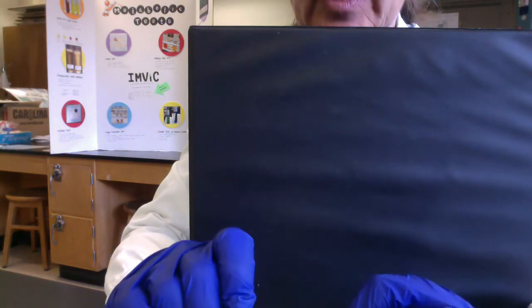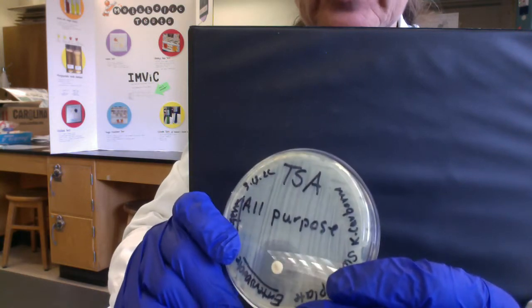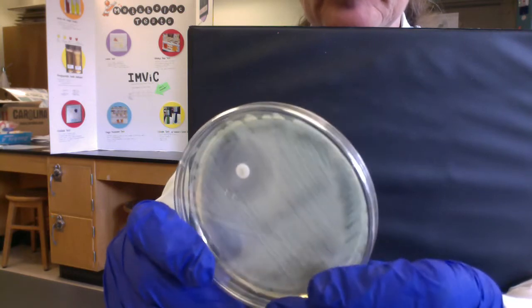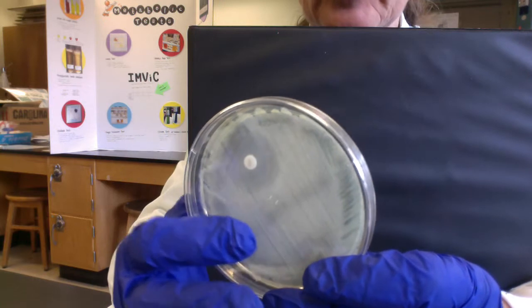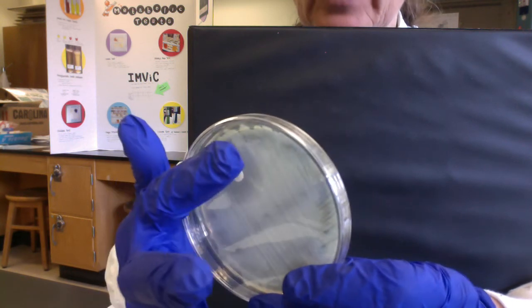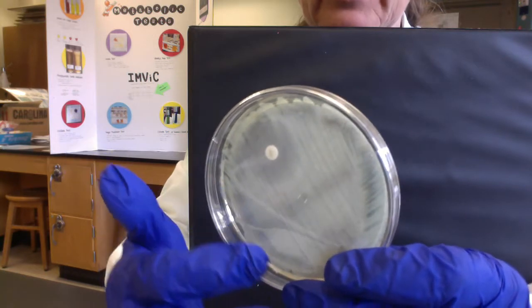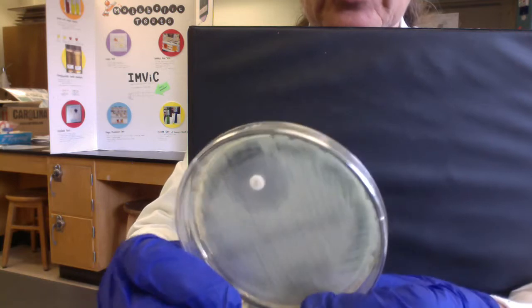This is a follow-up on our plates that we swabbed to get confluent growth. You might recall this is a totally different goal. When we swab plates to get confluent growth, we want the cells growing so closely together that when they form colonies, all the colonies touch one another and merge. That's called confluent growth. Another way of thinking of it is we've almost frosted the surface of the agar with bacterial colonies.